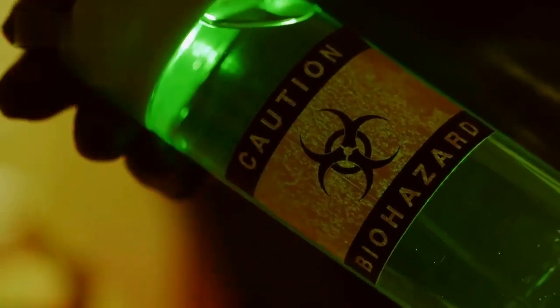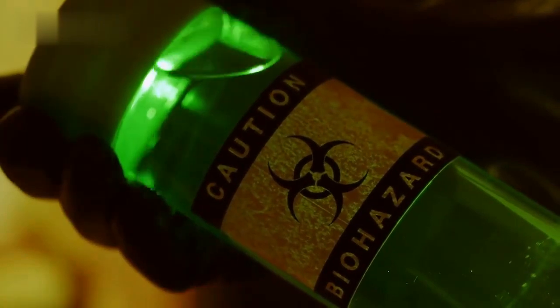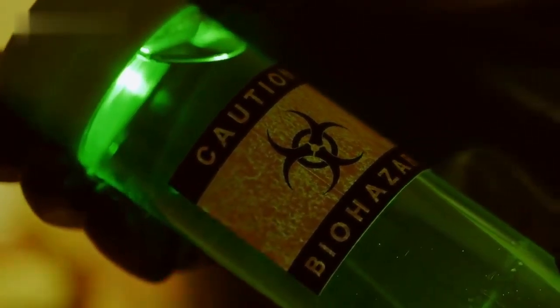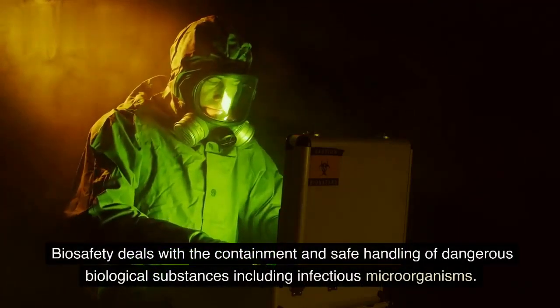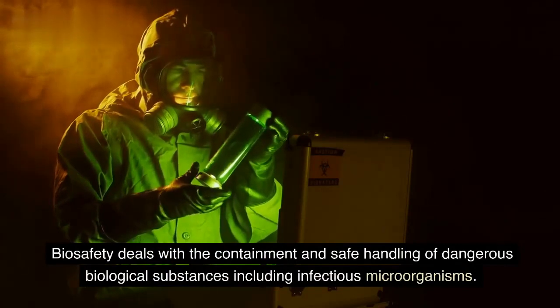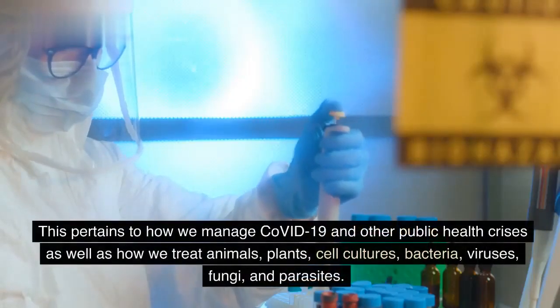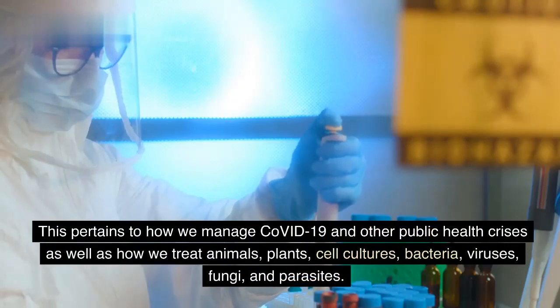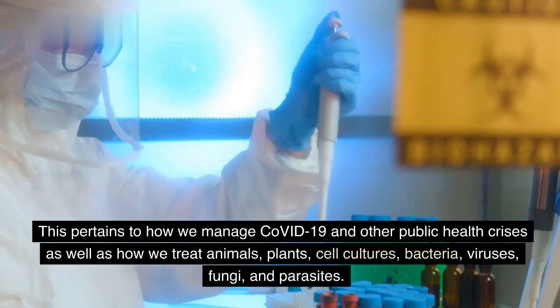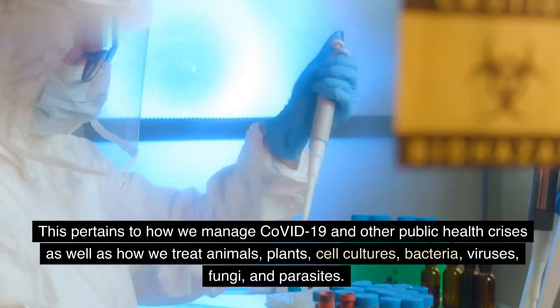In order to protect ourselves and our research facilities from potential dangers, it is important that we adhere to biosafety and biosecurity practices. Biosafety deals with the containment and safe handling of dangerous biological substances including infectious microorganisms. This pertains to how we manage COVID-19 and other public health crises as well as how we treat animals, plants, cell cultures, bacteria, viruses, fungi, and parasites.